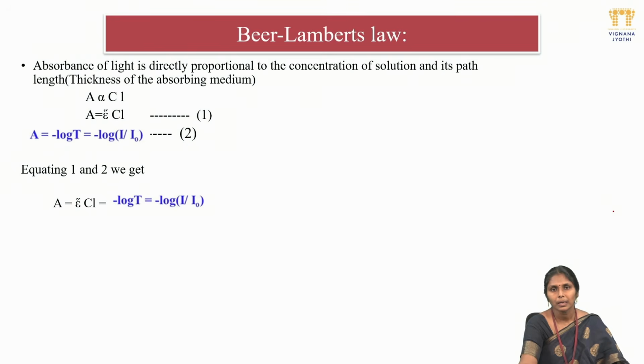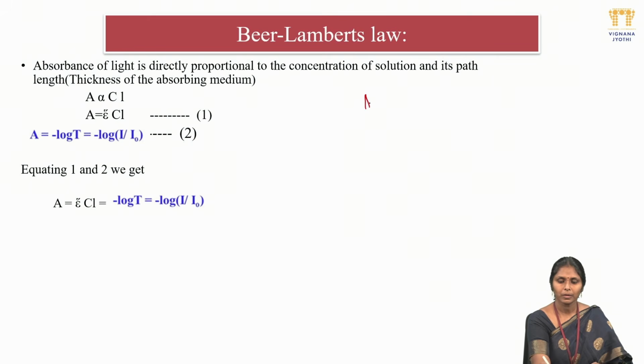Now coming to the Beer-Lambert law. What is Beer's law and what is Lambert's law? Here we are using different concentrations, that is 5 to 35 ml.